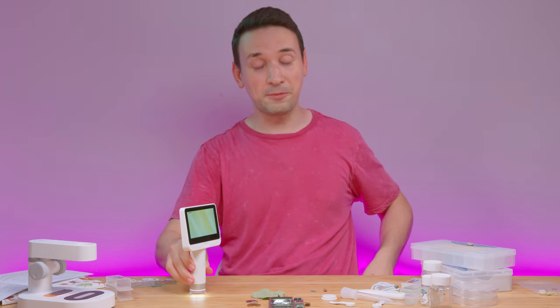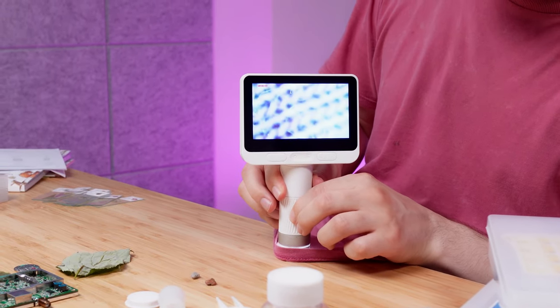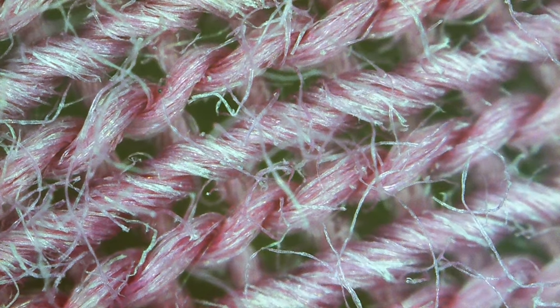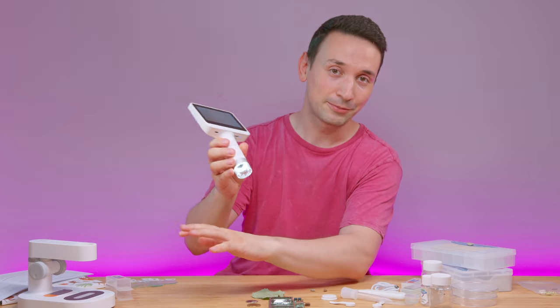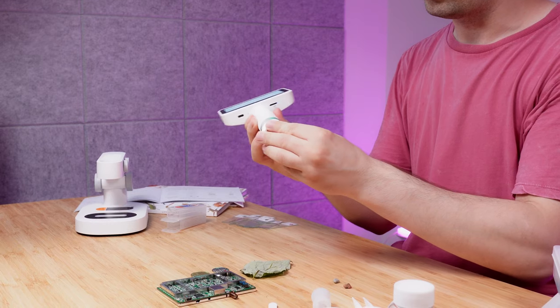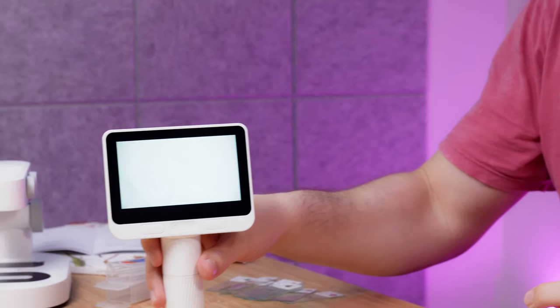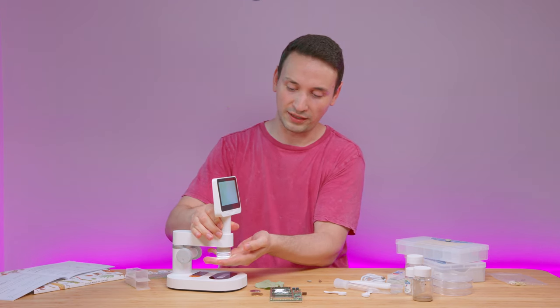First thing I did when I got this was go around the whole house. Even looking at my shirt — you wouldn't think it looks like this, but when you zoom in you can see all the stitching. Anything you zoom in on looks pretty cool, except when I put it on my arm. I know everyone who gets this is going to zoom in on their skin — so to save you the trouble, that's how it's going to look. The device also comes with lens caps to keep dust out.